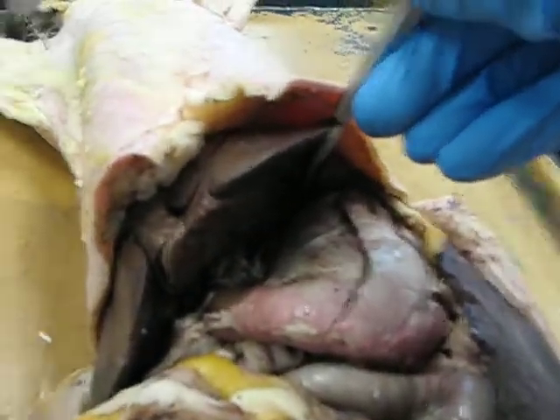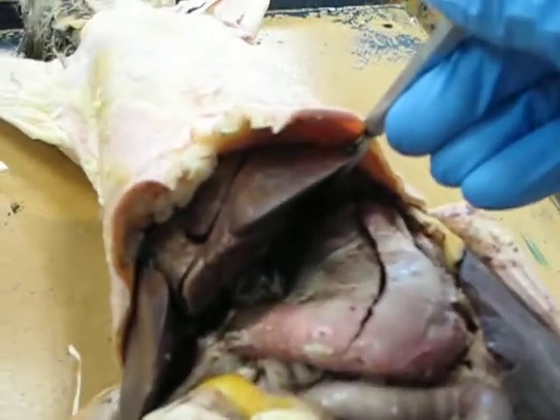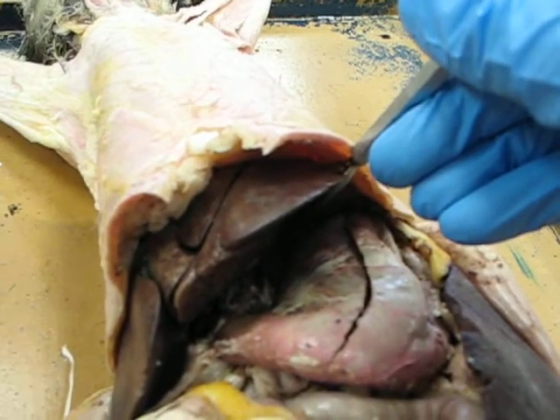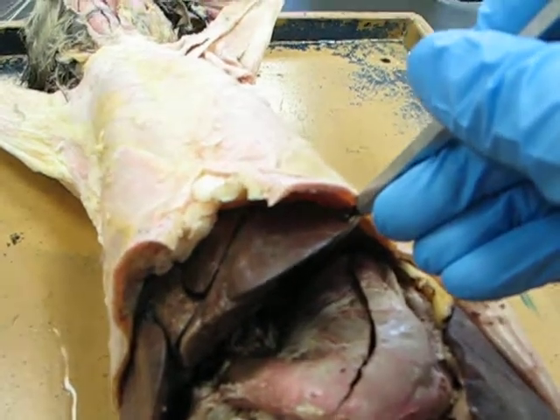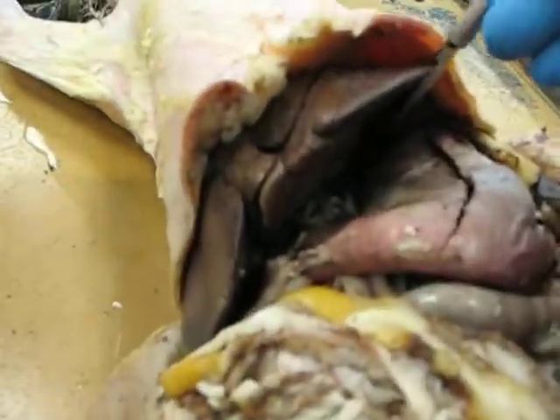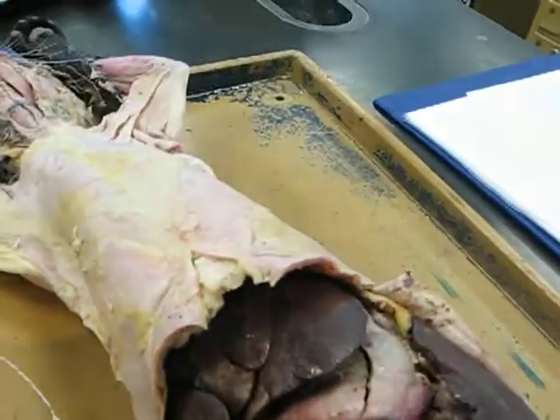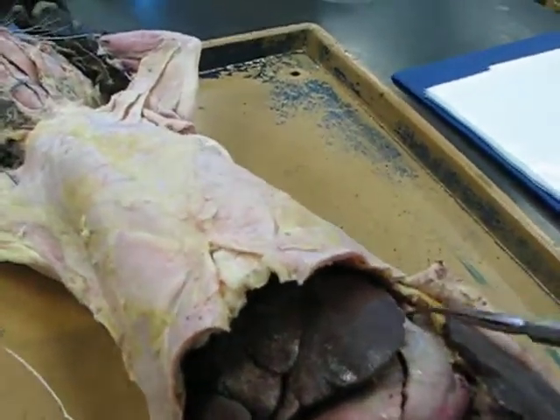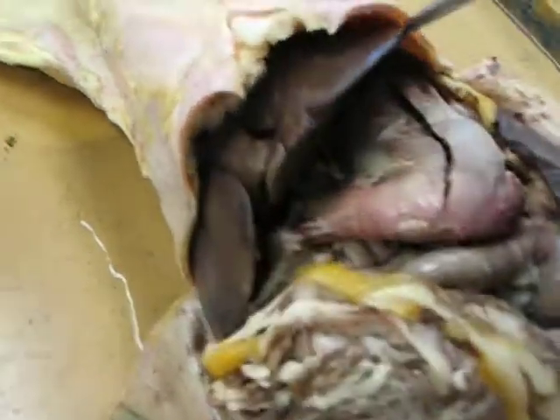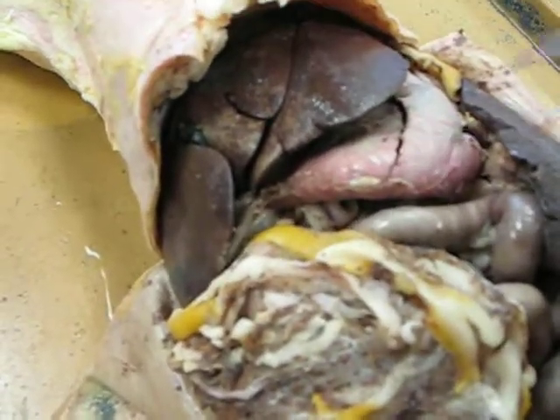Up top, at the very top in the stomach, is the cardiac sphincter. We have the fundus, which is the upper curvature. The lower curvature is called the pylorus. This curvature along the outside. Fundus up top, pylorus down below.